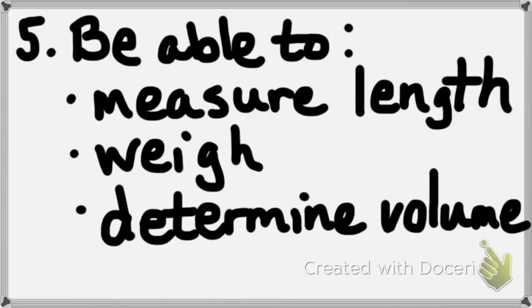Okay, now I have to do the volume of this seashell. What do I use? Now I use the graduated cylinder. Do I need any water? Do you put the water in before or after the seashell? Before. Do you have to know how much? Yes. Okay, I'm making this up. Let's say I put in 15 mils of water. I dropped the seashell in. It went to 22 mils of water. What's the volume? 7 milliliters. What did you do there? Subtraction. Good.